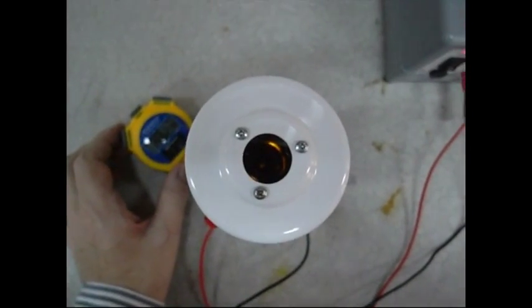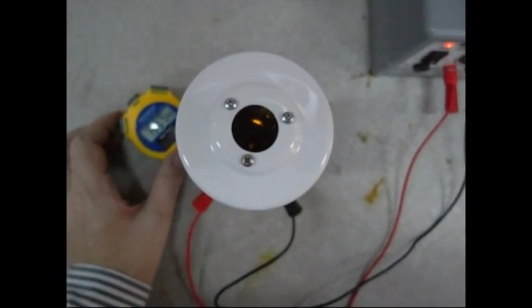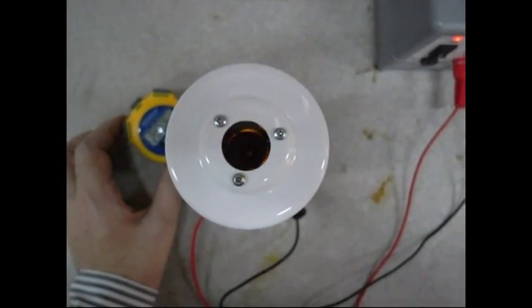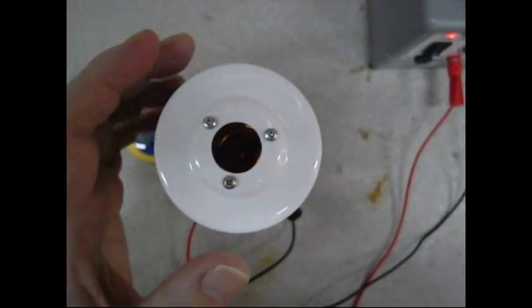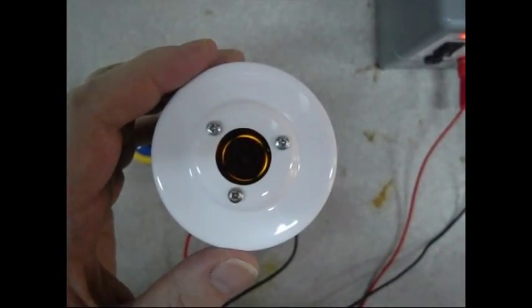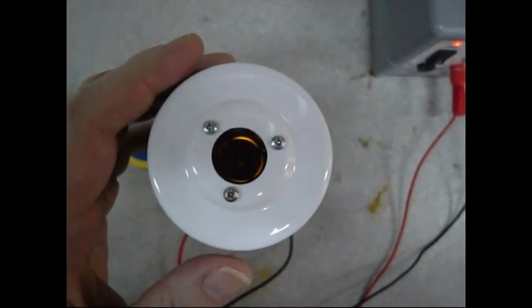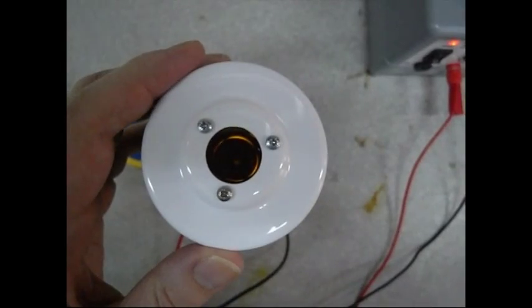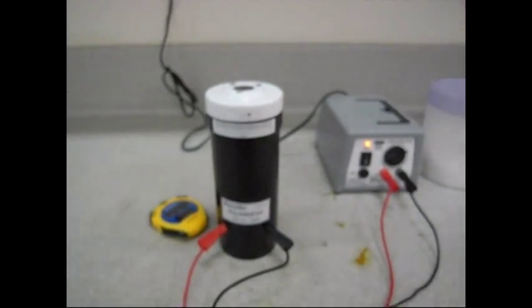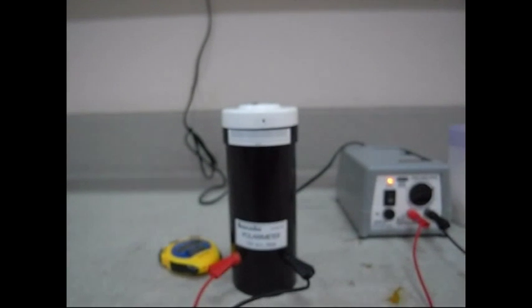We're just coming around to the reading at 20 minutes — the clock reads 54, 55 seconds. You should be able to see a small bit of light coming through the polarimeter. Let's extinguish that light and take the reading — we've now moved up to about 53.5 to 54 degrees.